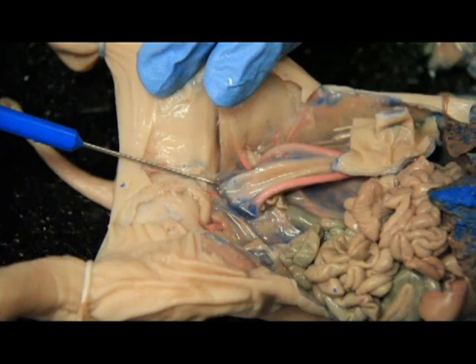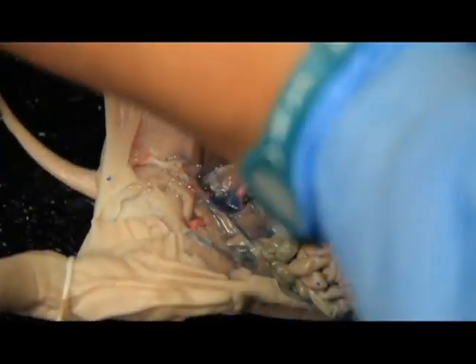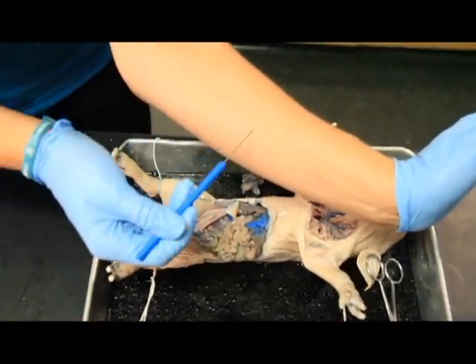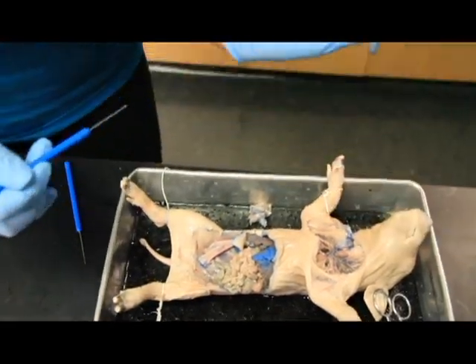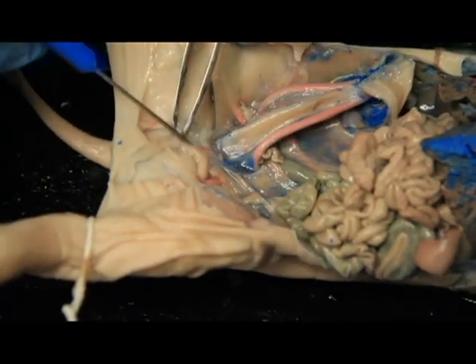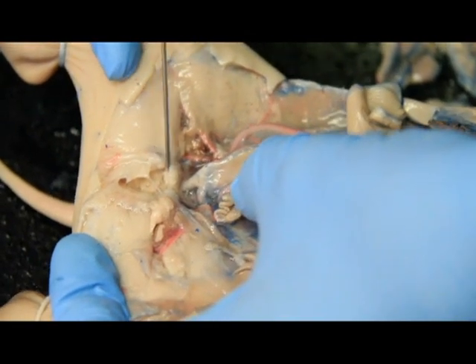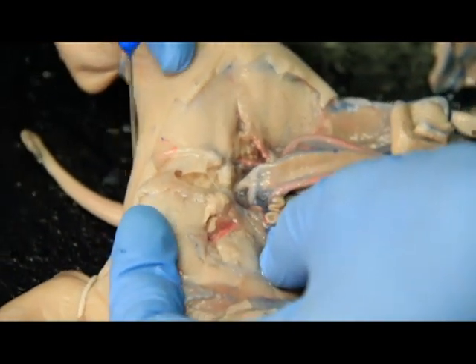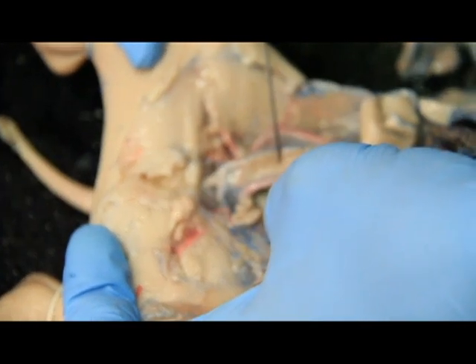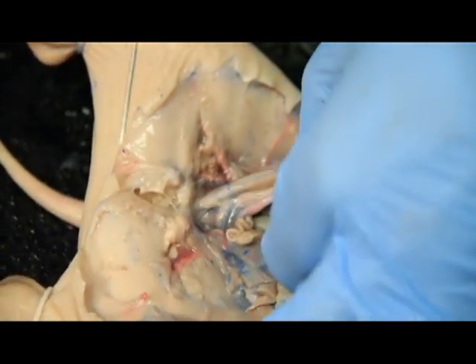Now under all this material right here, it's going to be a little tube, and if you continue down the branch of the Y from right here, that's the body of the uterus, but if you keep going down here, this is actually her vagina. And then it comes up and out the urogenital opening. So her vagina is going to be buried under all this stuff here, so we would actually have to dig through this here. About right here is going to be our vagina. And going from the vagina to the urogenital opening, there's going to be a very small tube that kind of comes back up and goes in that 180-degree flip towards that urinary bladder. And that's going to be the urethra.